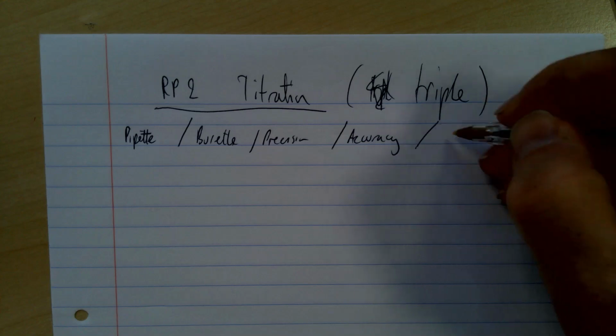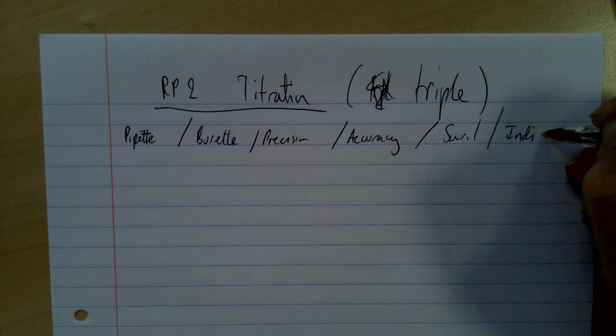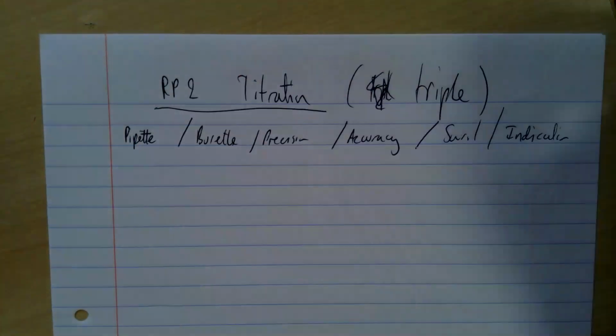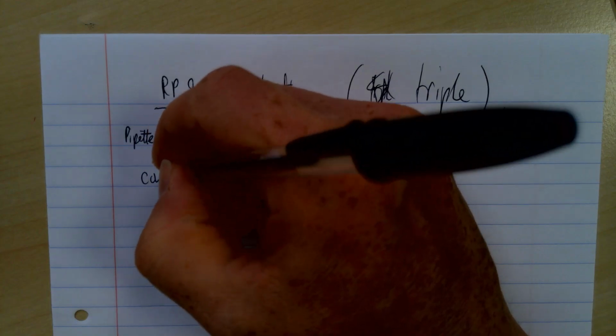Use words like swirl. Talk about the indicator, the special indicator you use. So make sure you know about phenolphthalein or methyl orange. Make sure you talk about the fact you're using a conical flask.